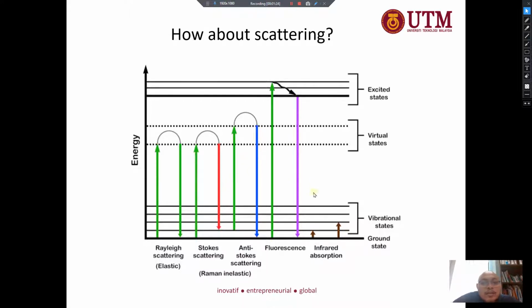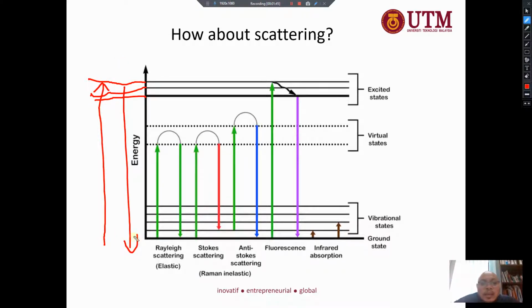So for the absorption, let's say I elongate this. In this case it goes for absorption and then goes for emission. For absorption and emission, it goes from the same excited state back to the normal ground state. But for fluorescence, it will relax at the excited state. Let's say, if you can imagine, here is your compound. You have 4 orbitals.